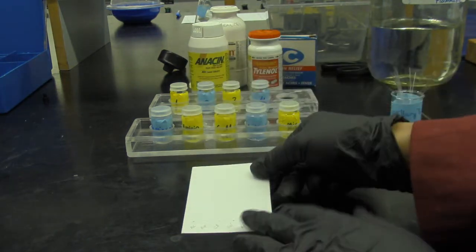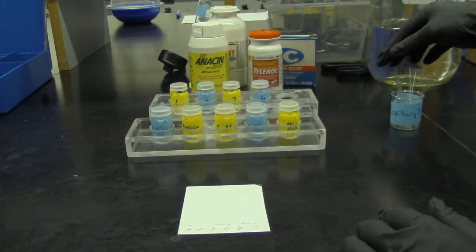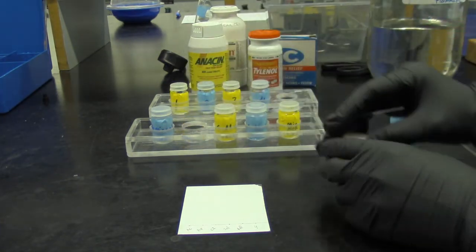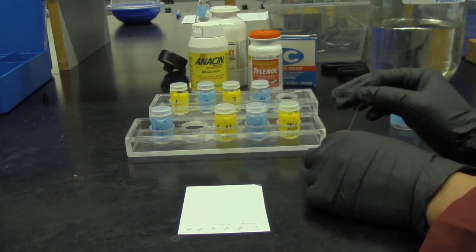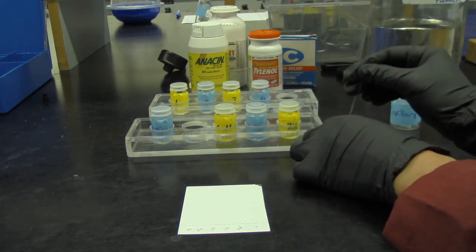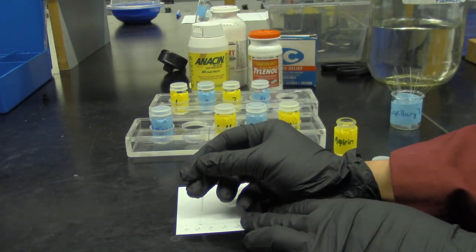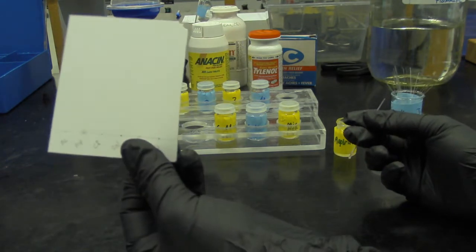I'm going to change the capillary tube, use a new one, to spot aspirin. Aspirin is in the second position. So I dip it, and then I'm going to spot it. I want to make sure the spot is as small as it can be.